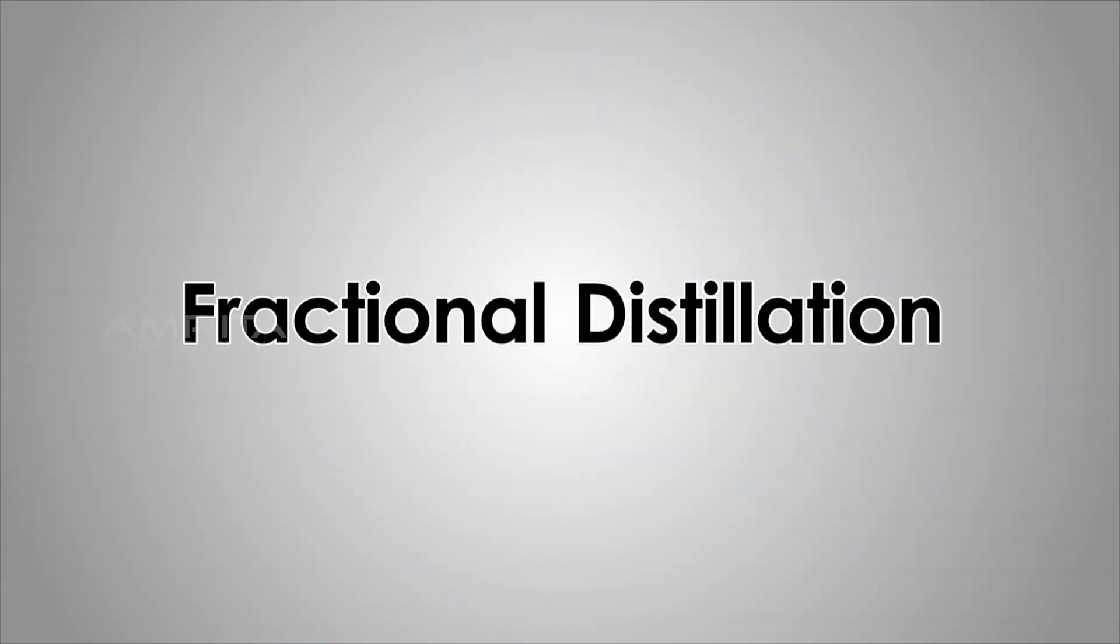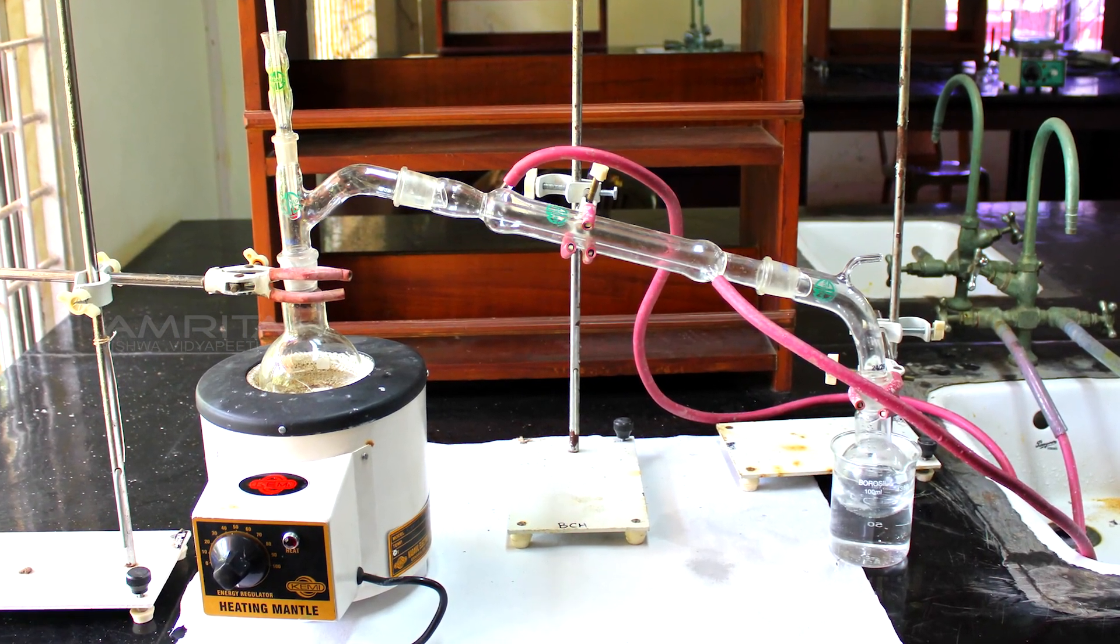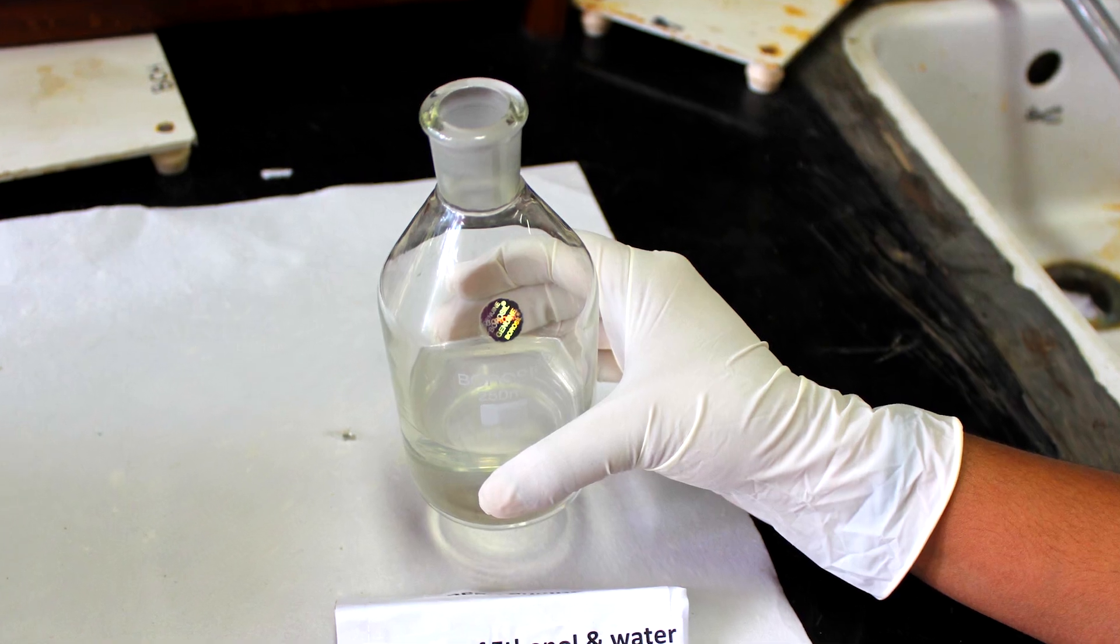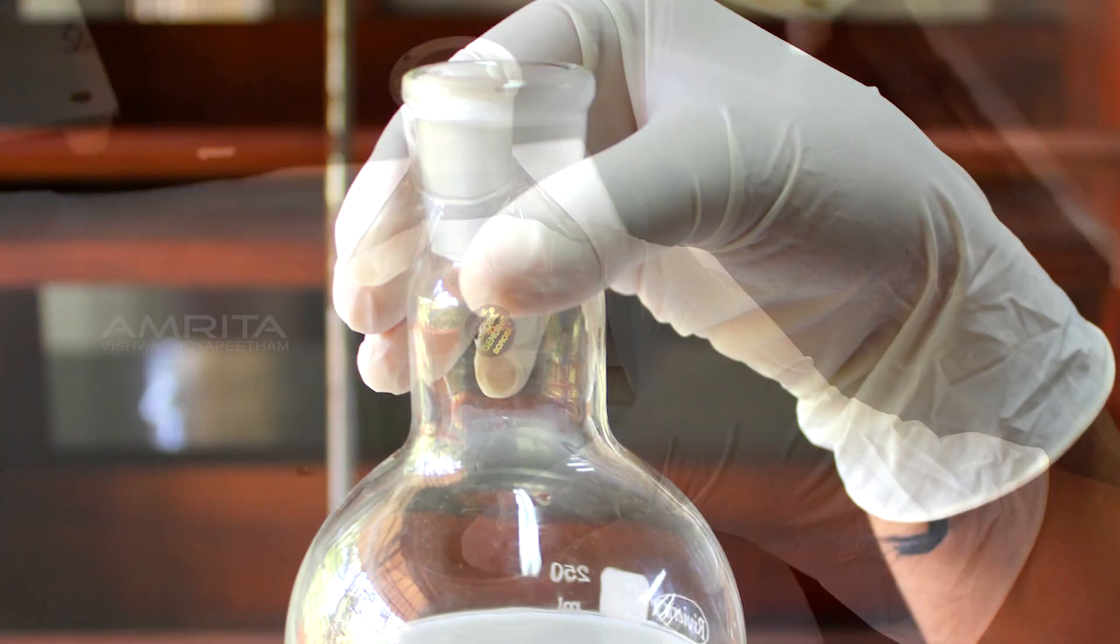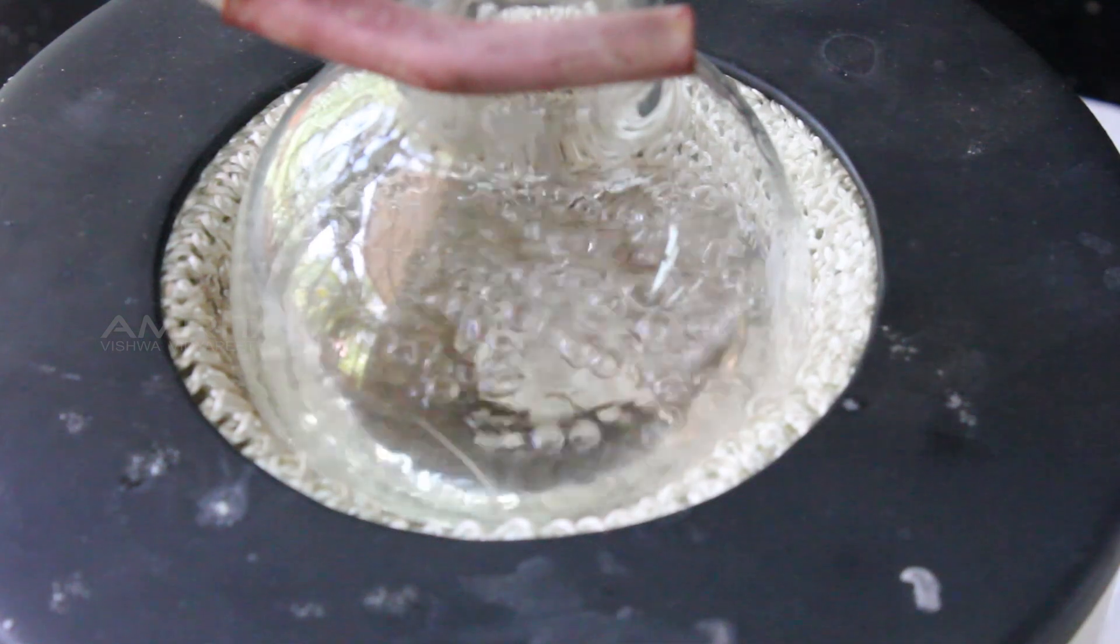Fractional Distillation. Fractional distillation is used for the separation of a mixture of two or more miscible liquids for which the difference in boiling points is less than 25 Kelvin.